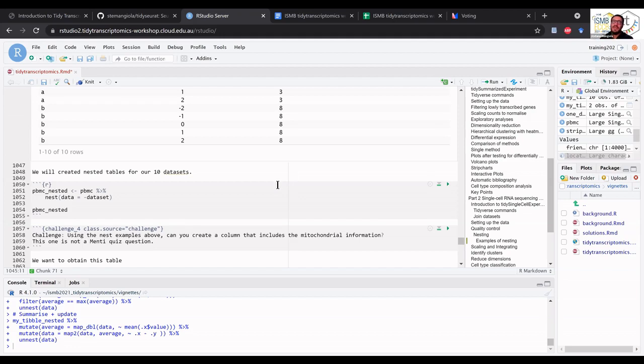So why might we want to subgroup our data set, apply independent calculations on our subgroups, and maybe merge all together? Well, we might want to group our data set by sample, apply some quality filtering by sample, and then put everything back. Normally, we have to split the data, so create a variable with a list of splits, apply a for loop, and then merge back. In this case, everything can be done through a pipe, no variables created, and less chance to introduce bugs in our code.